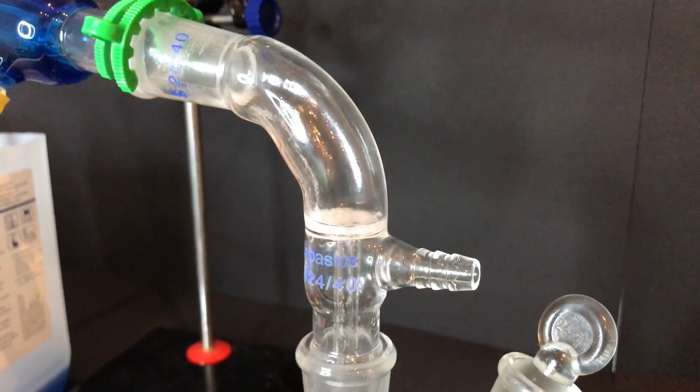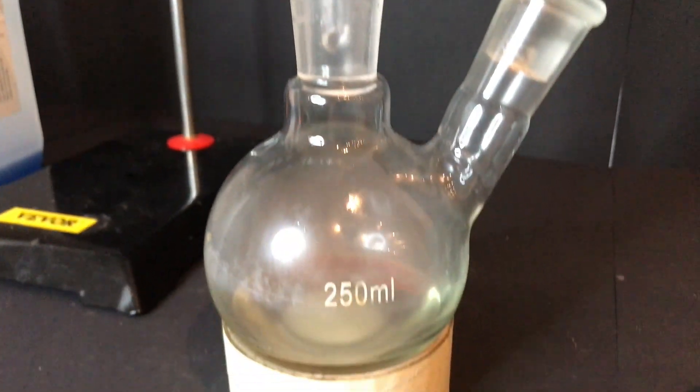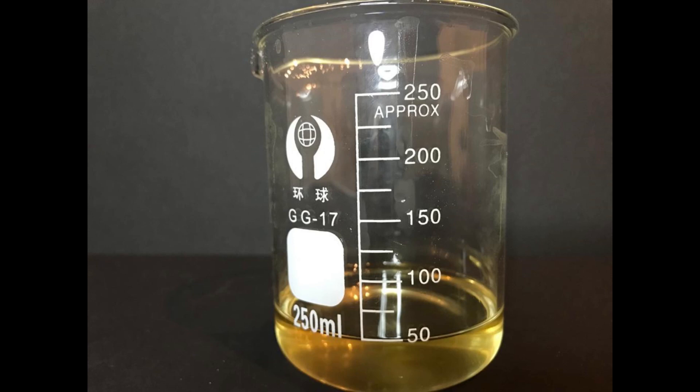The cyclopentanone mixture is yellow, indicating contamination. The cyclopentanone was filtered and then put into a beaker. Now we can see we are left with 50ml of cyclopentanone and water mixture. The cyclopentanone would be used for the next Cubane episode.